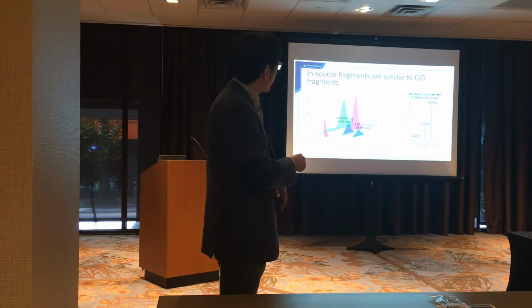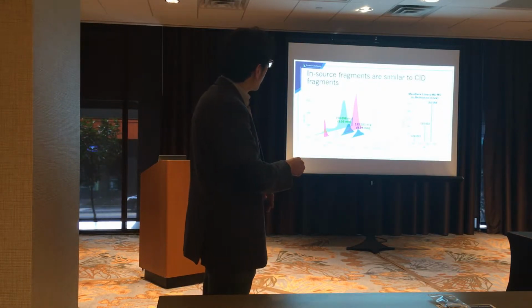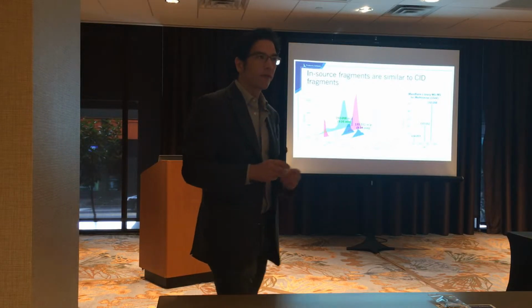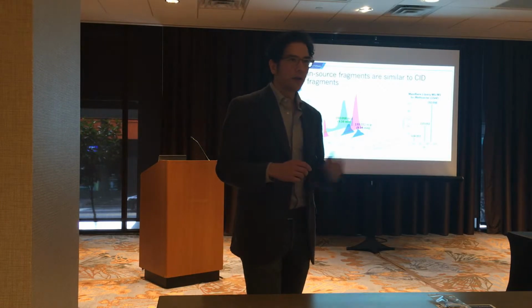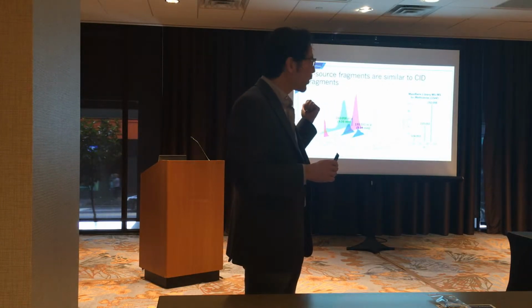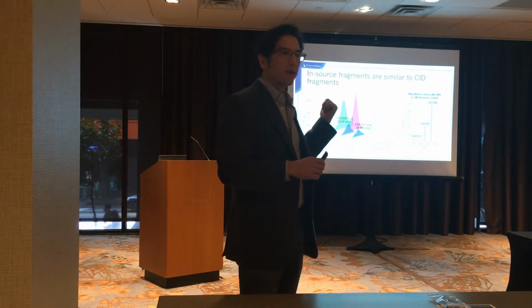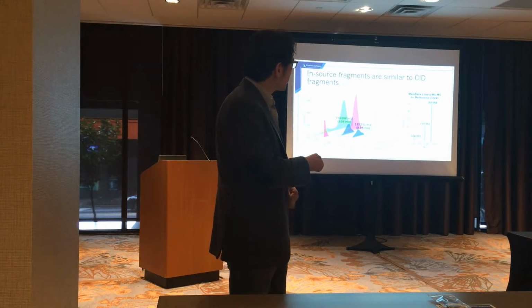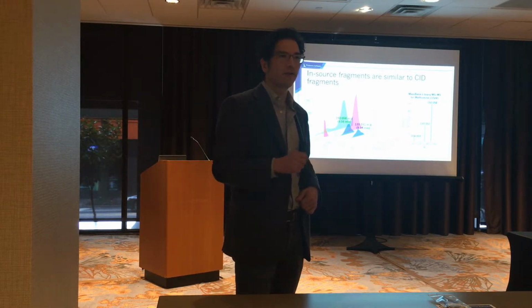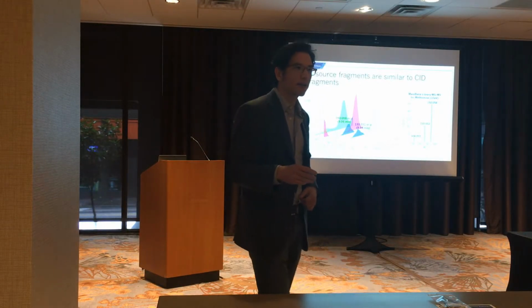So this peak right here is methionine, and this peak right here is an in-source fragment that is basically from the library. But if you see around this peak, there's a ton of really highly abundant features, and this is just in a very small MZ space. So this precursor was never selected for DDA, right here. So we were never able to actually collect an MS2 for this one. But we actually have an MS2 signature for this peptide just in the MS1 space. Does that make sense?